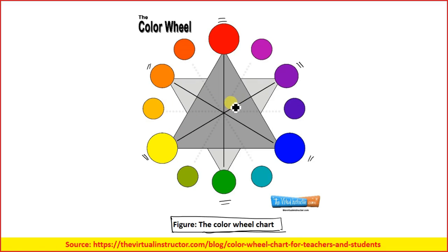Suppose you want to pass this red color. What will happen? You have to use a green filter. If you use a green filter, suppose I have a radiation source over here, then I have this green color filter, which is optically transparent to a certain extent.